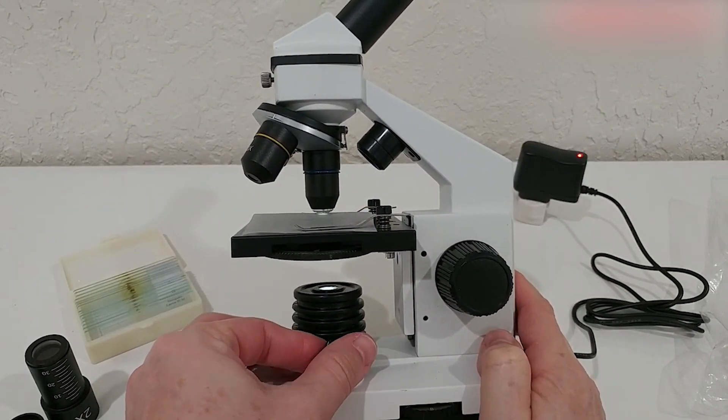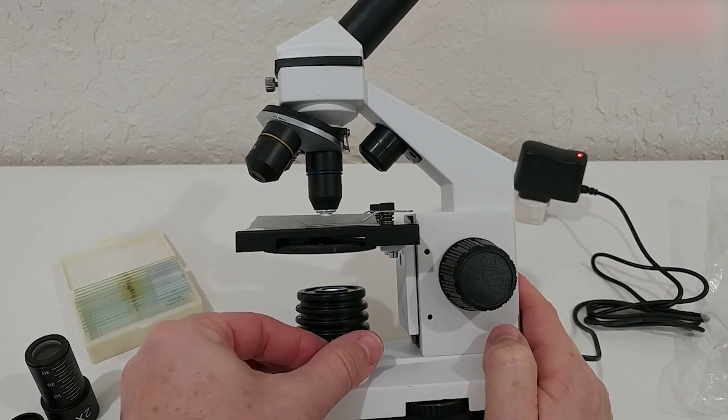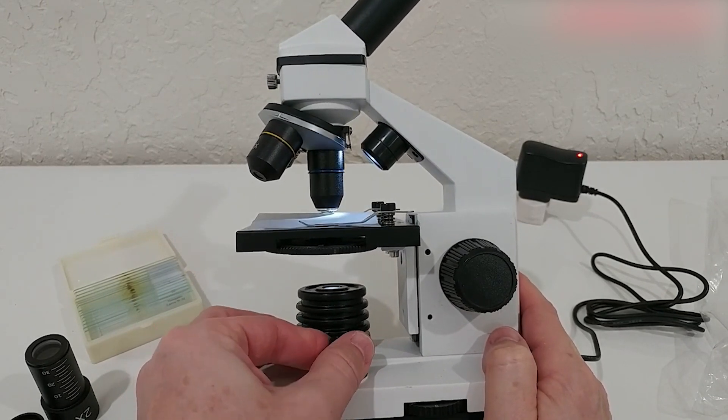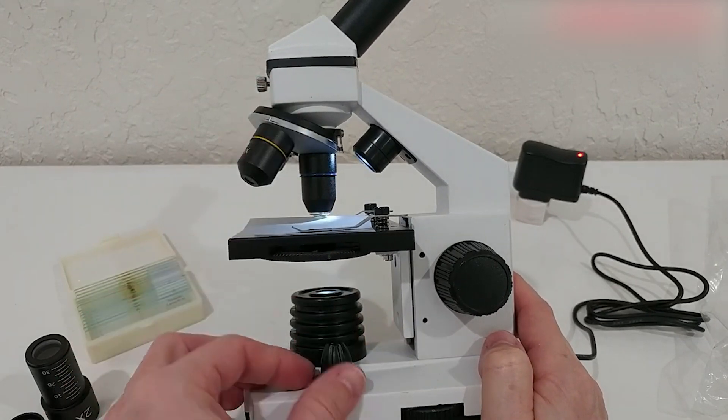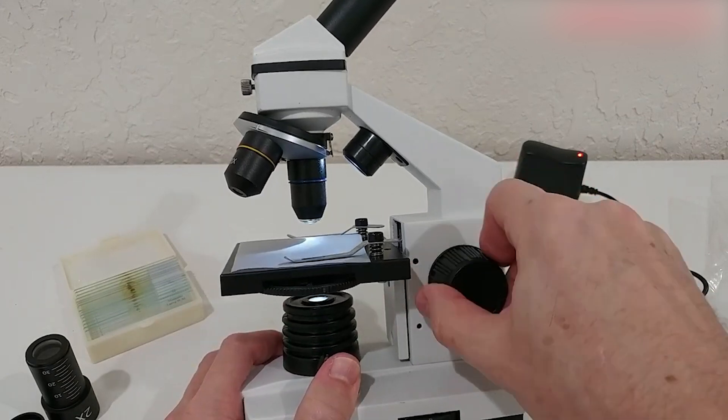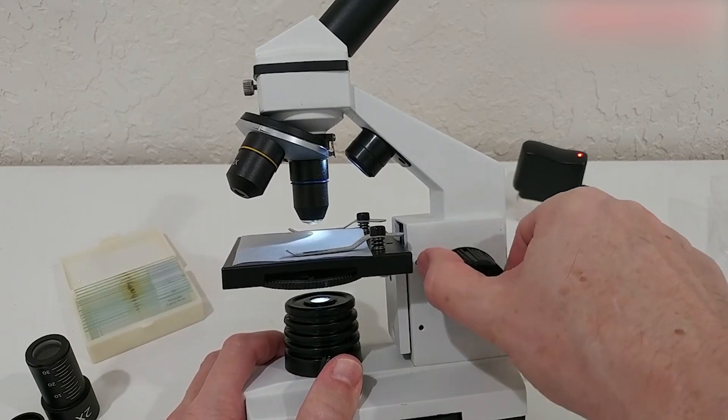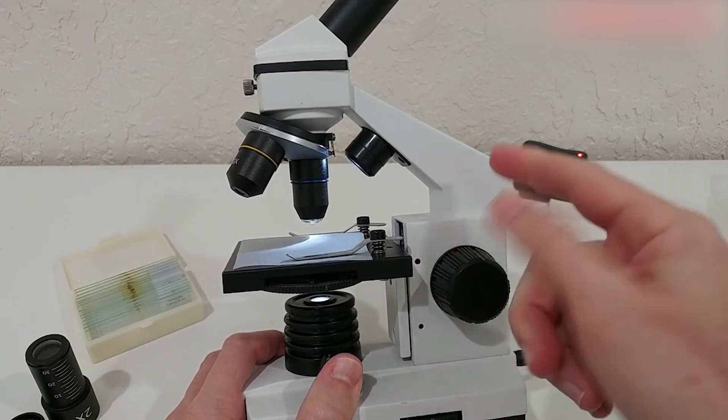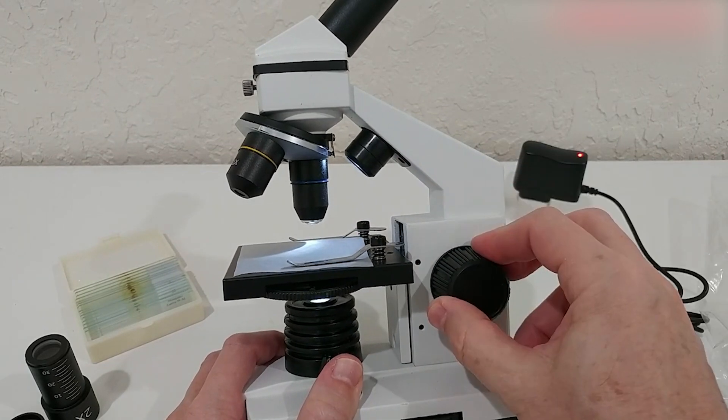The inclusion of a 0.65 NA single lens condenser with a disc diaphragm enhances image quality even further, delivering high-resolution, color-corrected images that reveal details in vivid clarity. You won't miss a thing when you explore with this level of illumination.